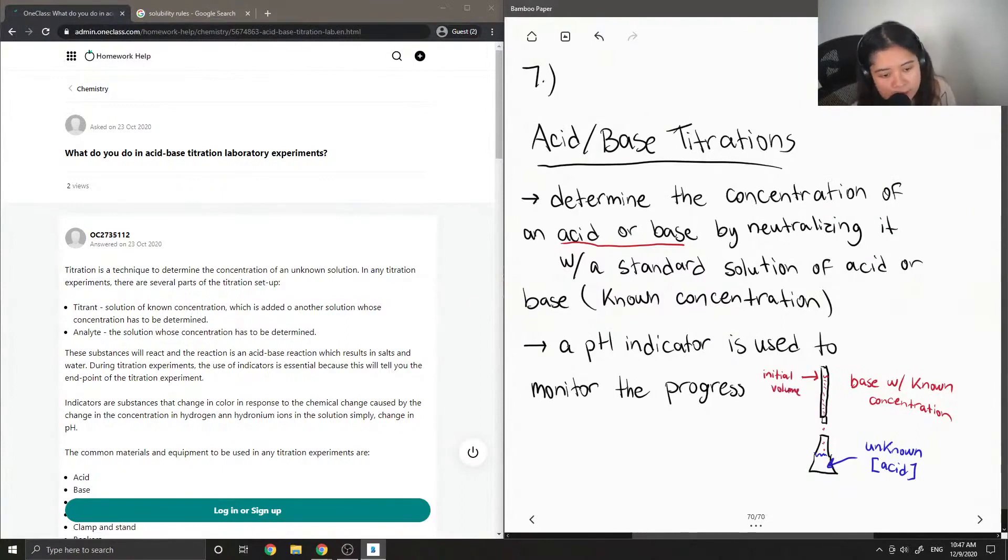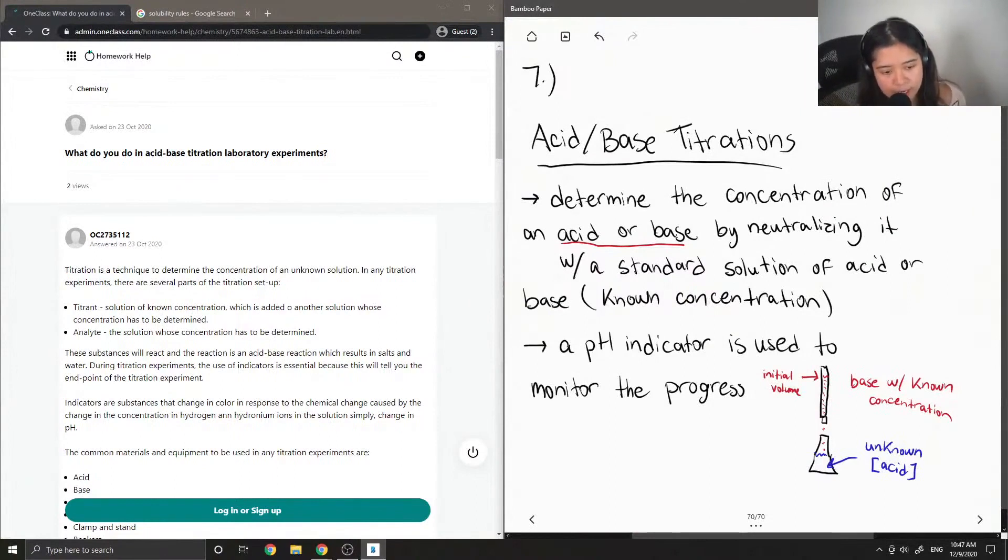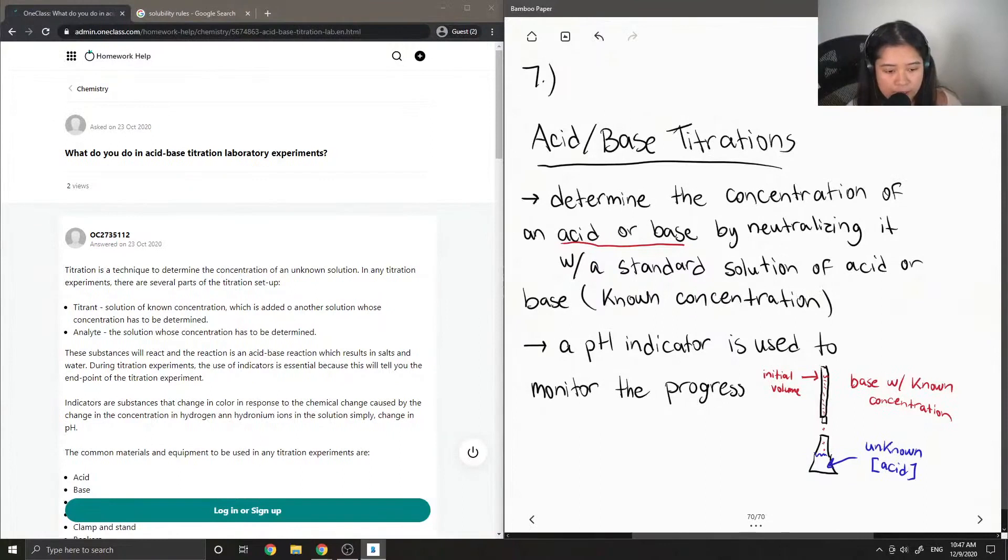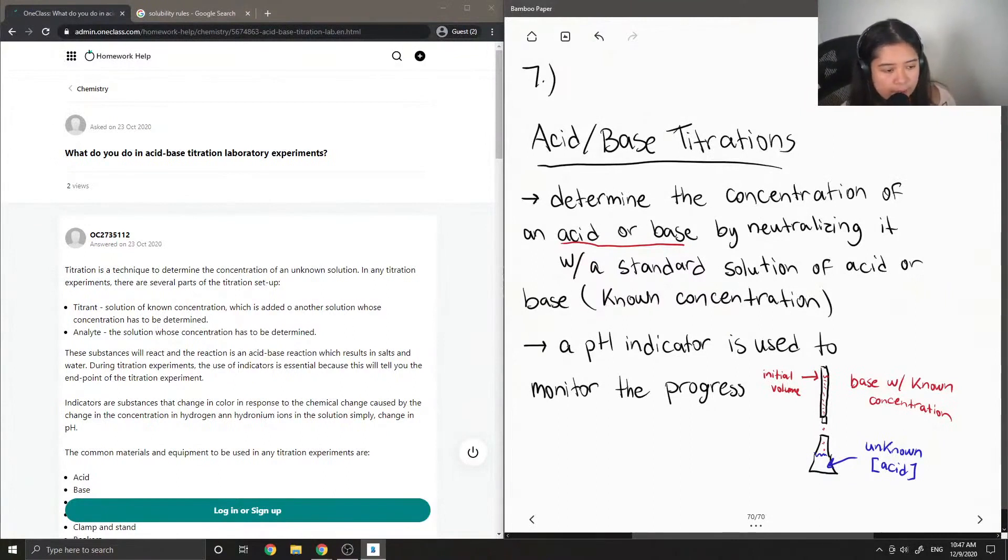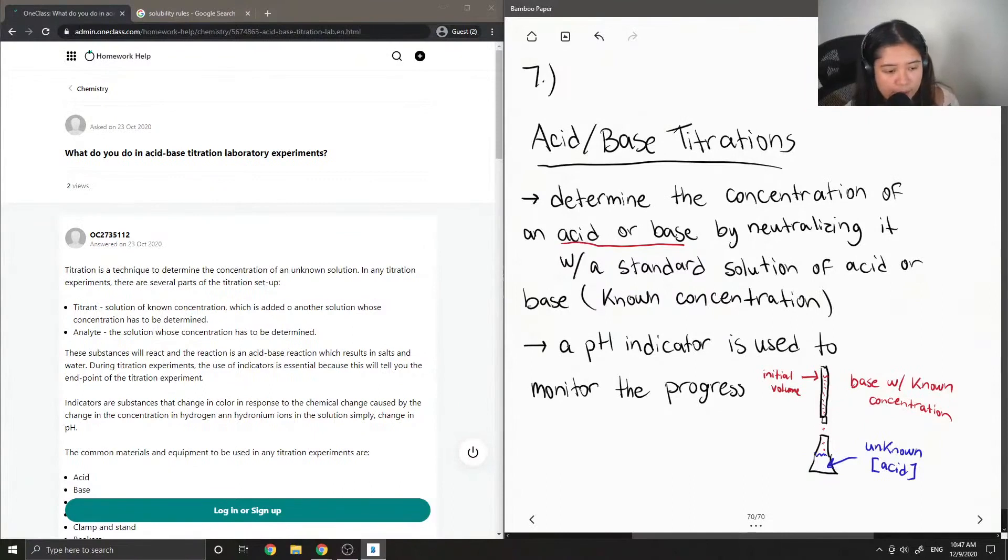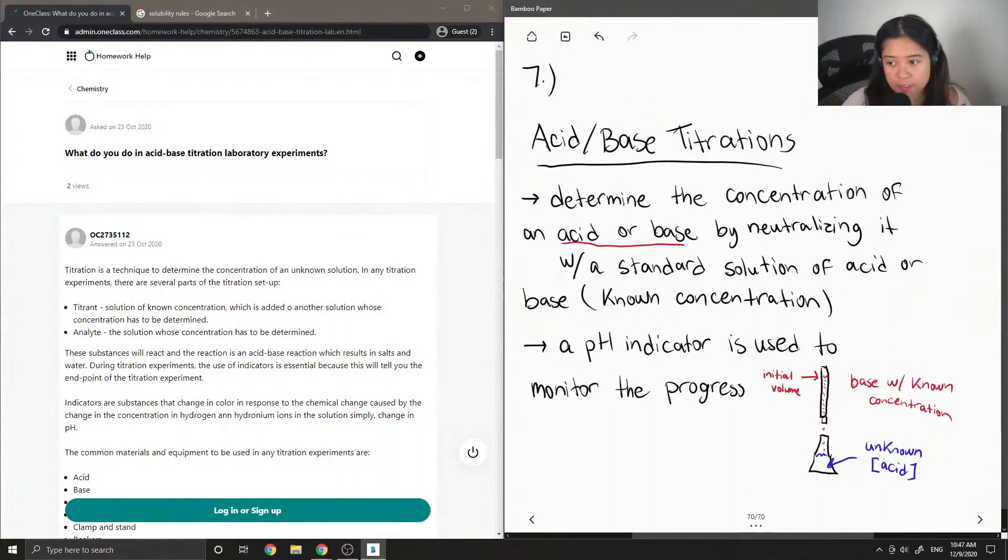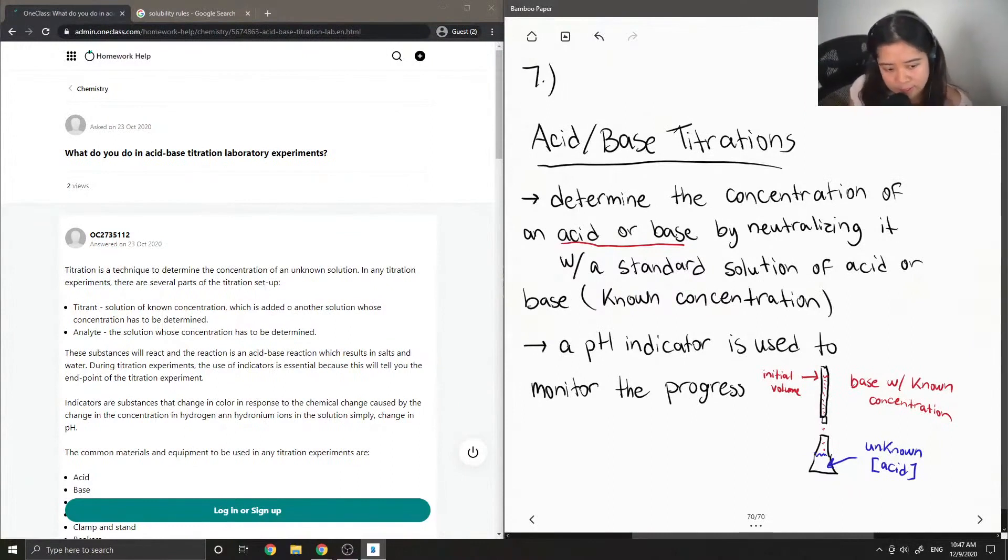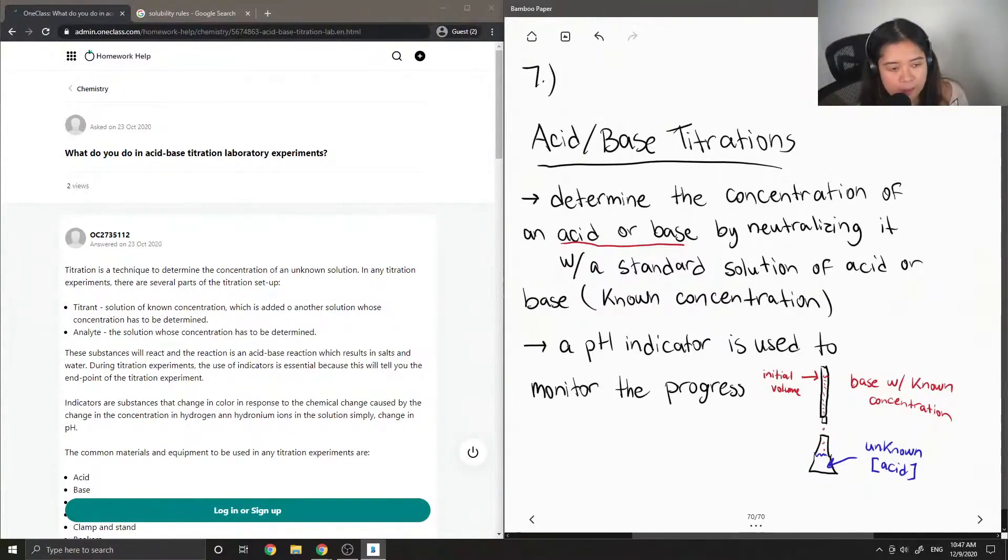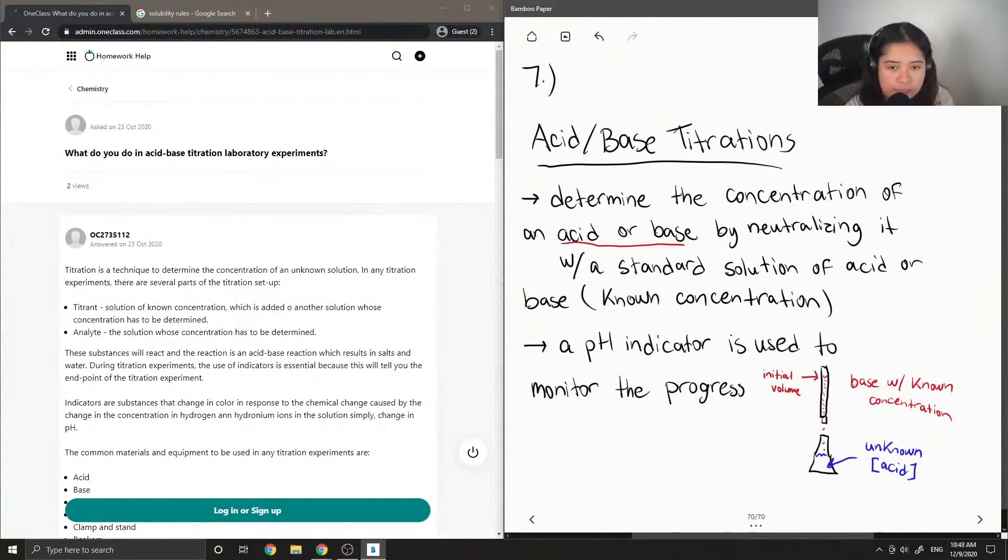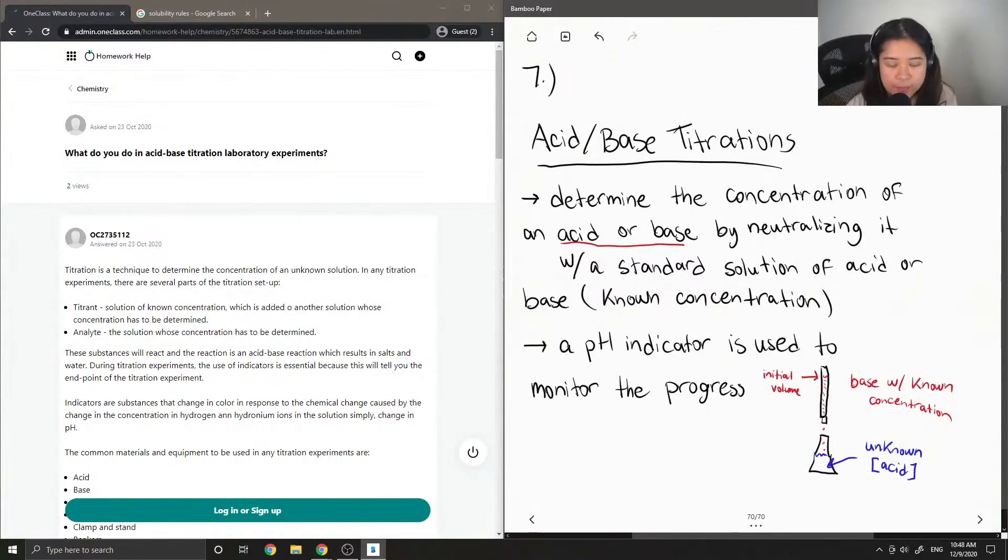Once we take note of the initial volume, we can start adding the base dropwise into our unknown acidic solution. A pH indicator is used to monitor the progress. Typically the acid will be colorless, but we can add a pH indicator such as phenolphthalein, which turns pink once the solution is neutralized and when it turns more basic.